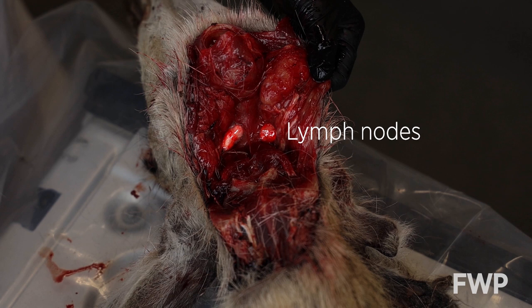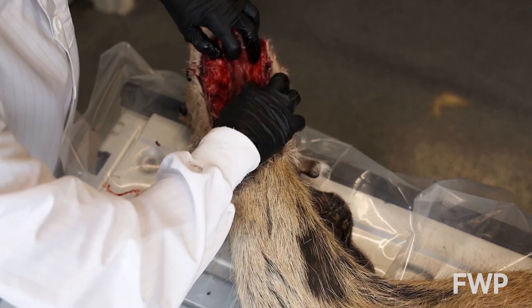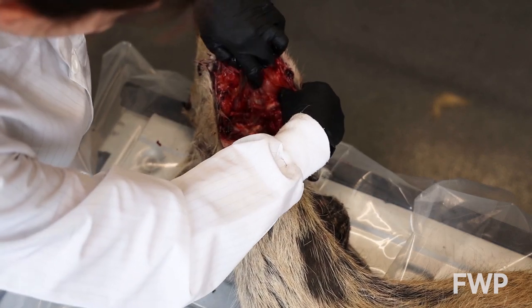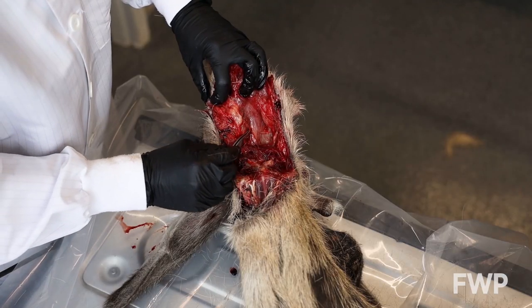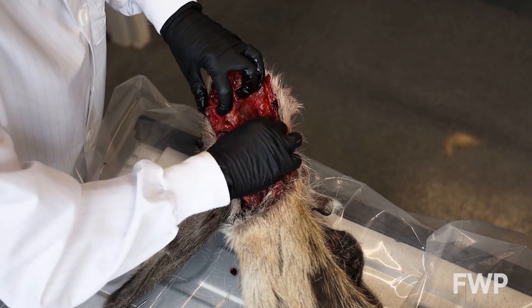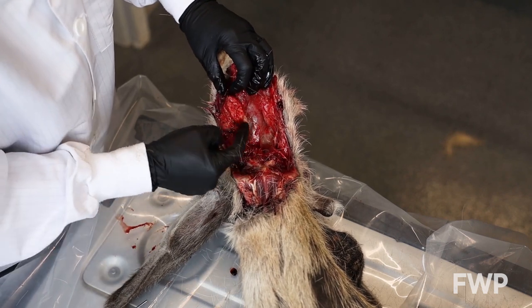Visibility of the lymph nodes may improve by holding the windpipe up and forward. Separate these tissues by hand or with a knife. Here we can see the first lymph node. Note its darker color, uniform structure, and smaller size compared to the salivary gland.